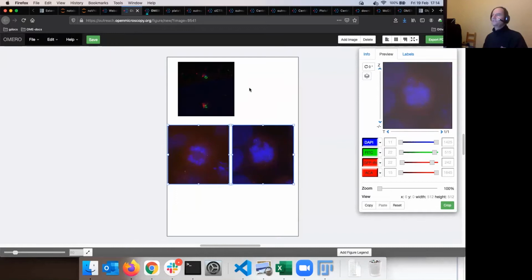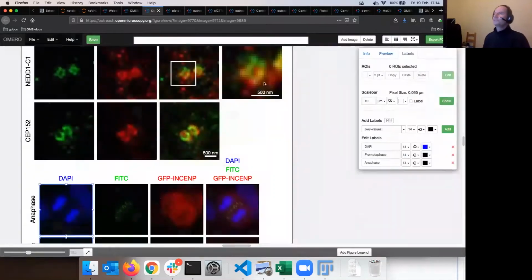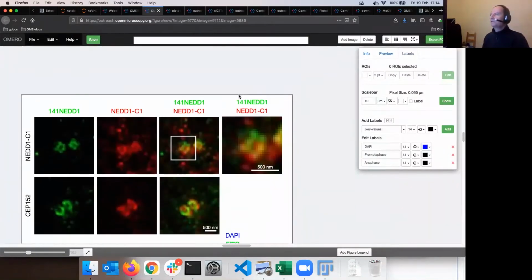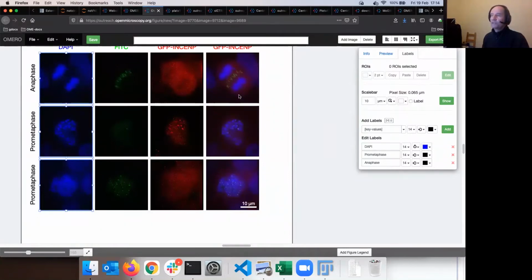Yes, you did. Thank you, Claire. So that's hopefully clear. We can go back to. Yes, of course. It warns me that you can't have an empty name because I was just in the middle of showing you how to save the figure, which I just did.